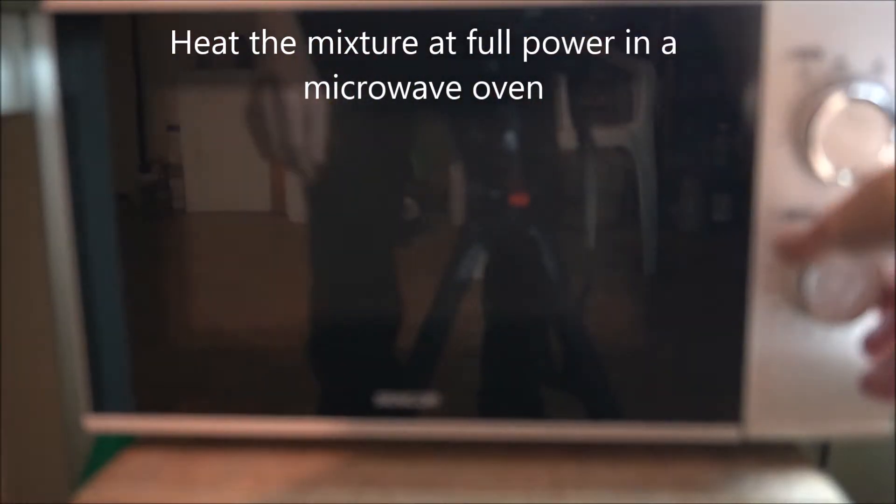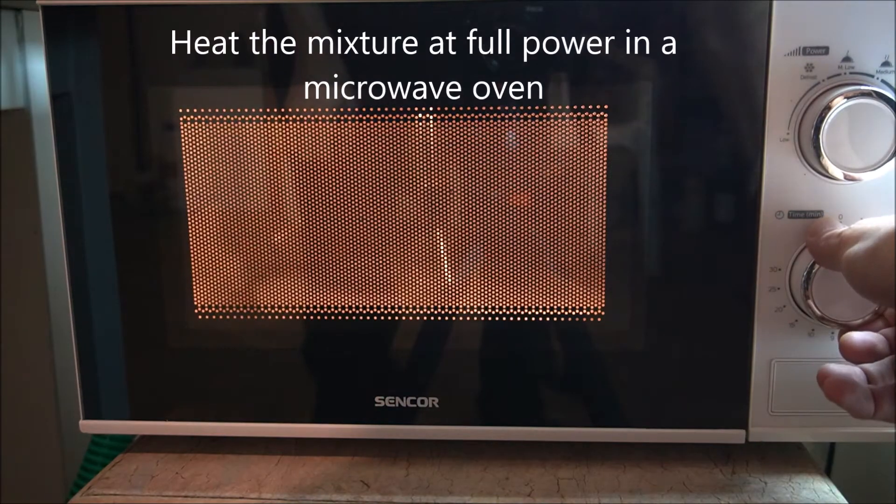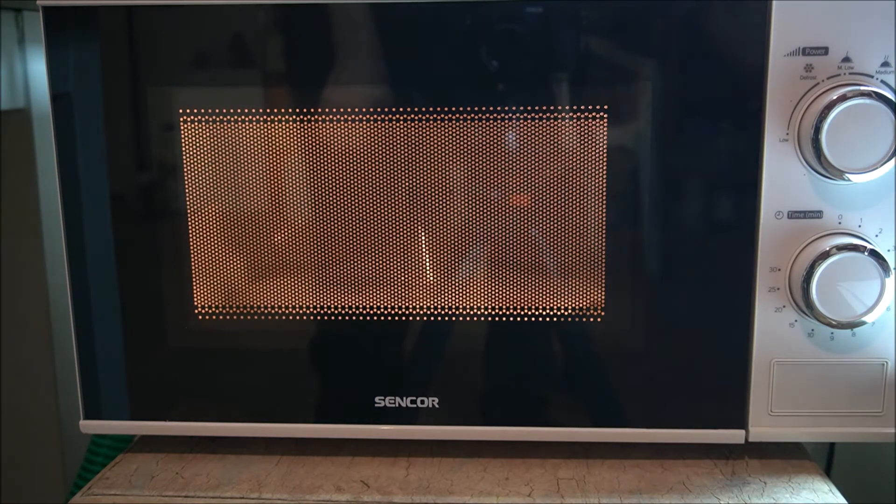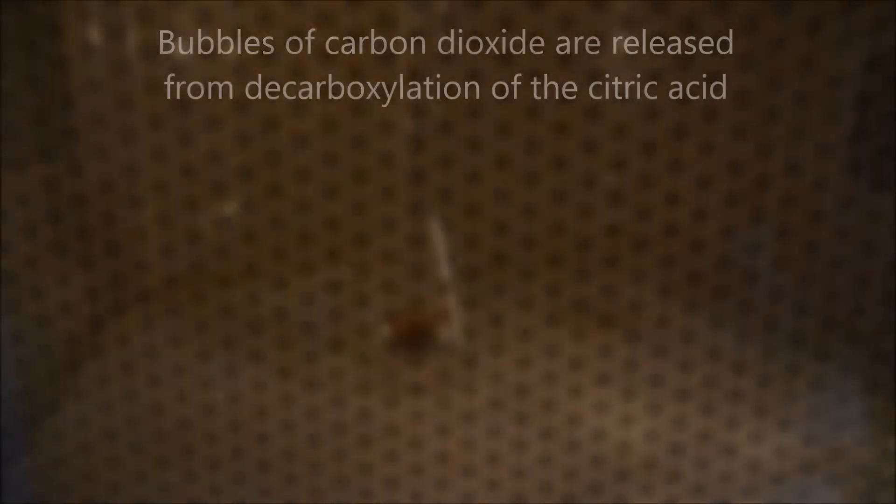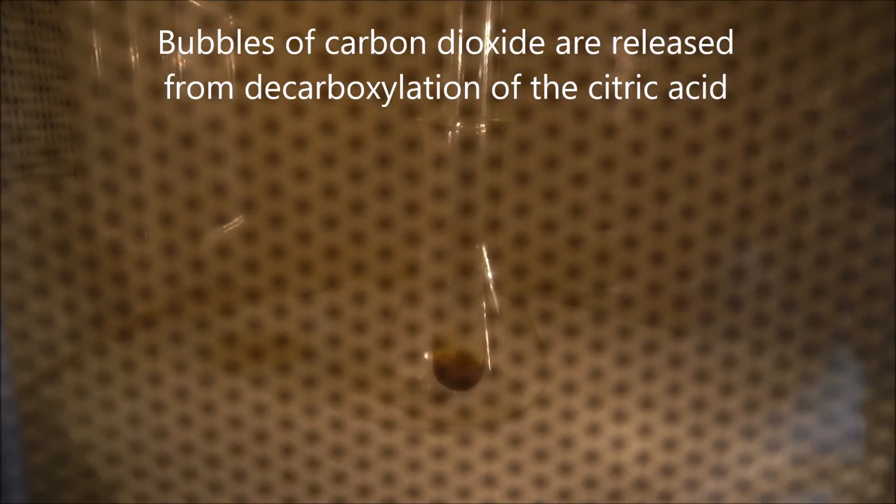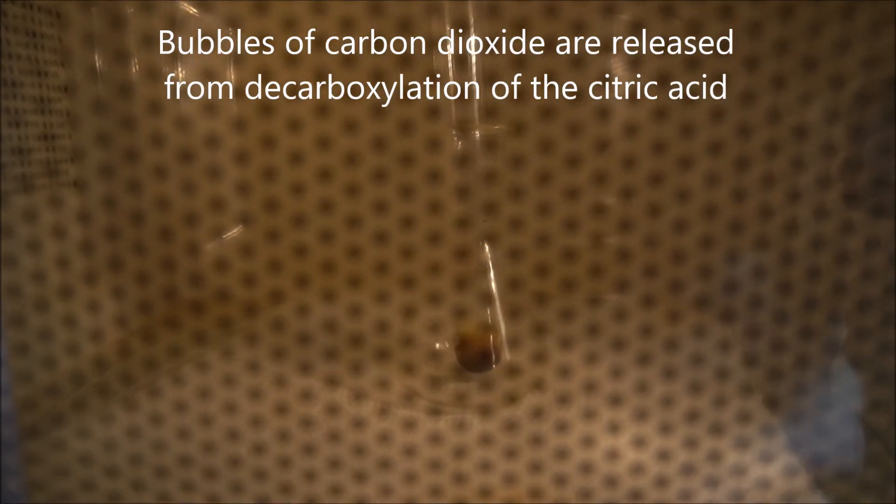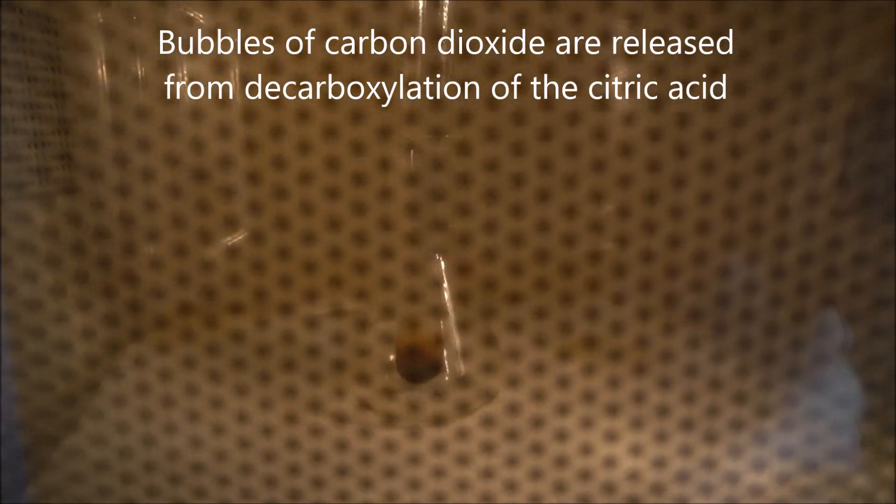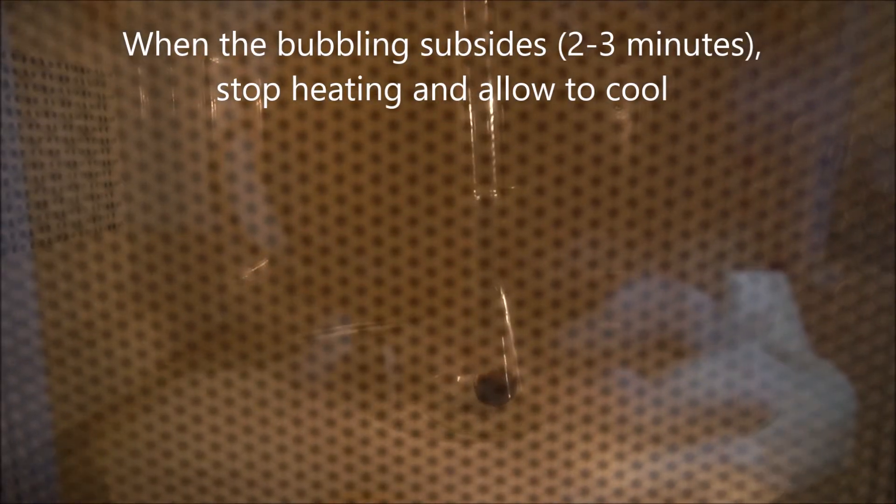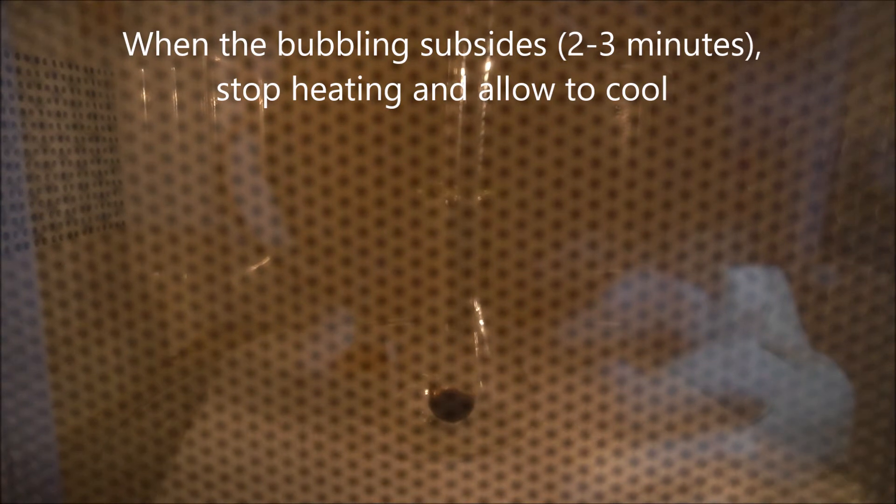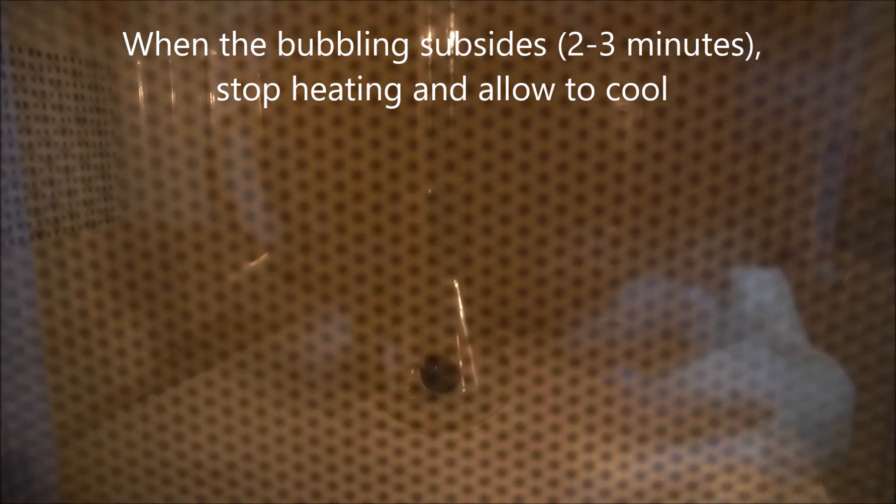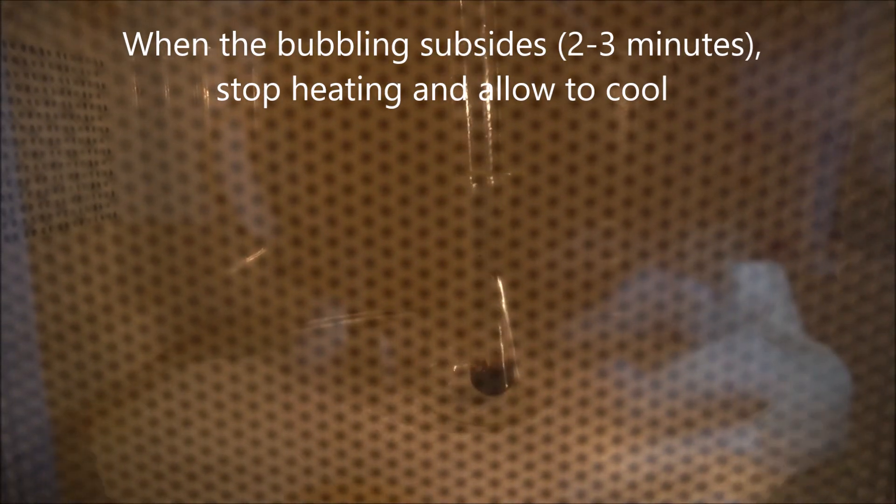Heat the mixture at full power in a household microwave oven. Bubbles of carbon dioxide are caused by decarboxylation of citric acid in the reaction mixture. In about 2-3 minutes, when the gas evolution is essentially over, stop the heating and let the reaction cool down to room temperature.